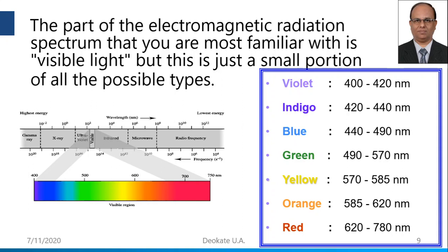Band of radiation means similar kind of radiations. Similar kind means if you say yellow light, it will not be dark, it will be dark yellow, it will be faint yellow, it will be greenish yellow, it will be reddish yellow. In that way, we can have certain tinge and every tinge will be recorded as a single wavelength. So they are called monochromatic. Chrome means color. Color is related to its wavelength.